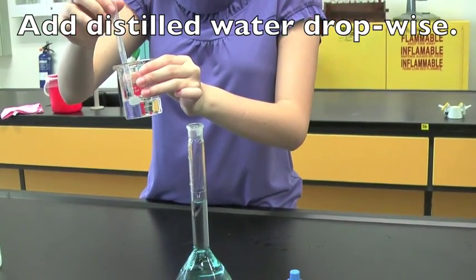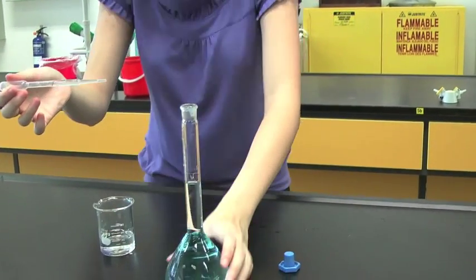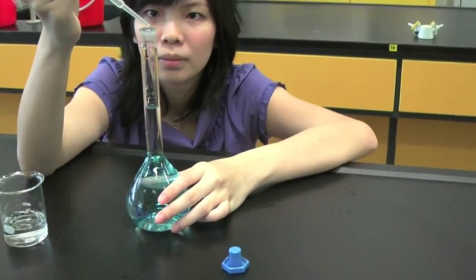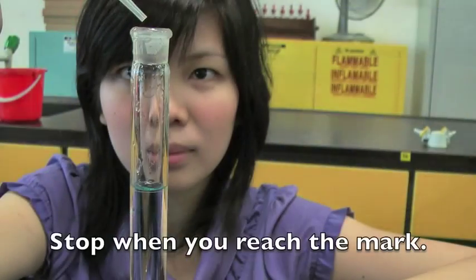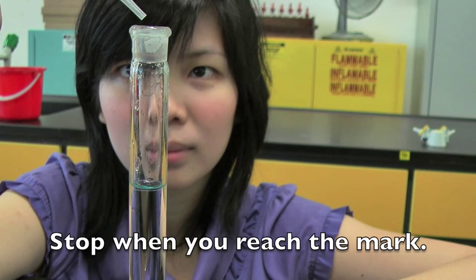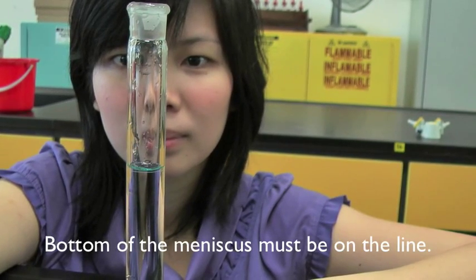With the use of a dropper, add distilled water drop-wise. Stop when you reach the mark. Check that the bottom of the meniscus is on the line.